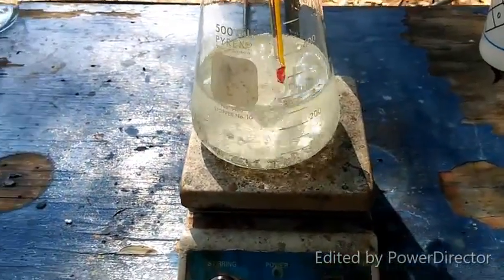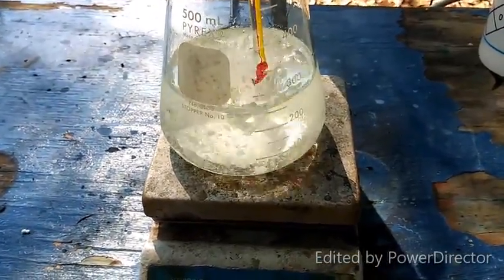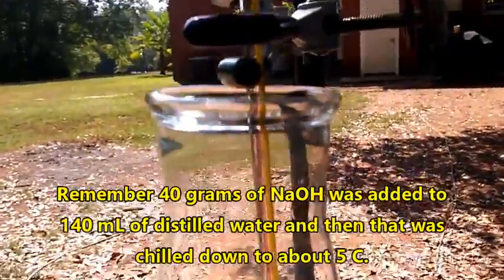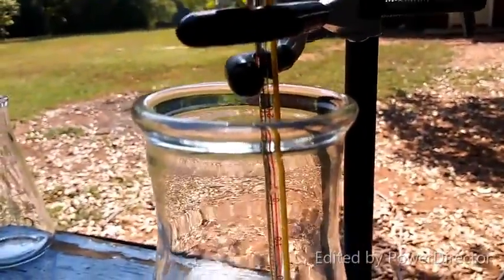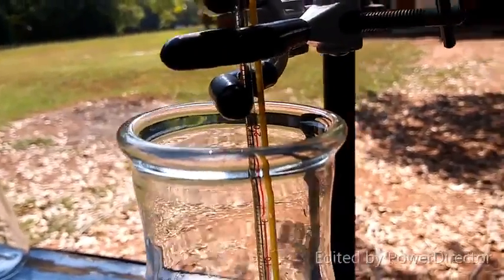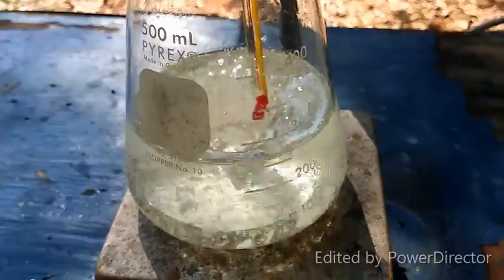Alright, it took a while, but all the phthalimide is almost dissolved. The temperature on this solution has gone above 20. I don't know if you guys can see this that well, given how much this camera sucks, but it's about 24 degrees C right now.